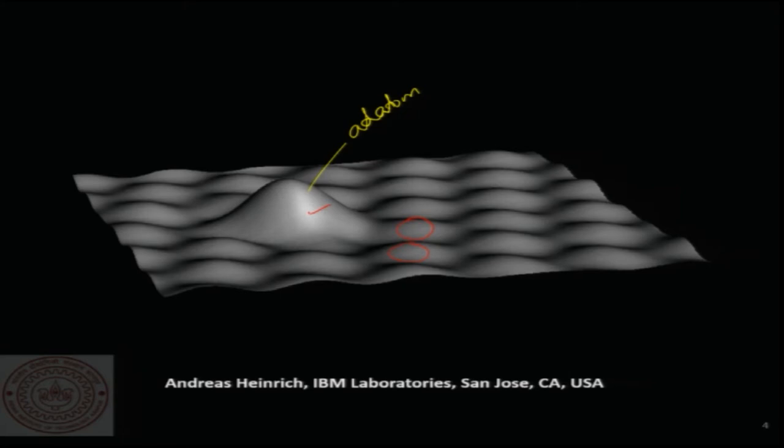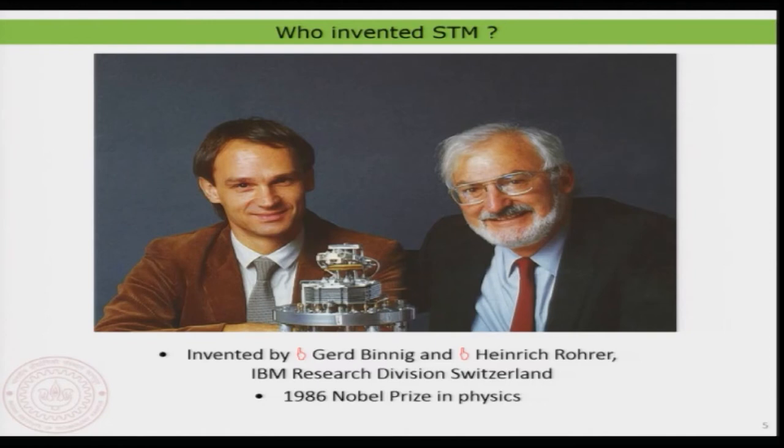So it is unimportant in this context what type of material you are using, because later you would find that it is hard to get material-related contrast in STM. But nonetheless, what you would be looking at is the electron density of the surface, and with that you can recognize the different positions of atoms on the surface, or what happens if you put add atoms on the surface, and so on. So we will look at several examples from now onwards, and then you can understand this a little bit better.